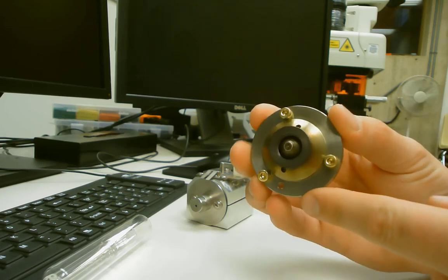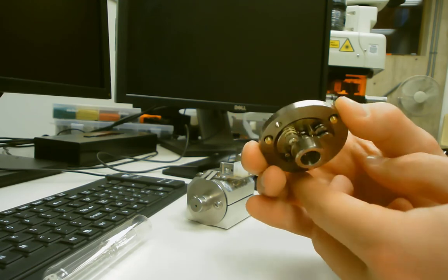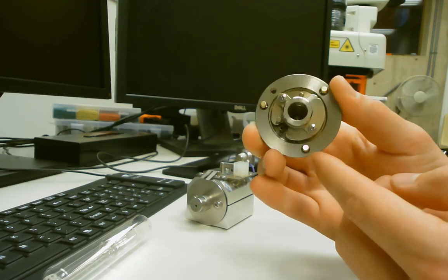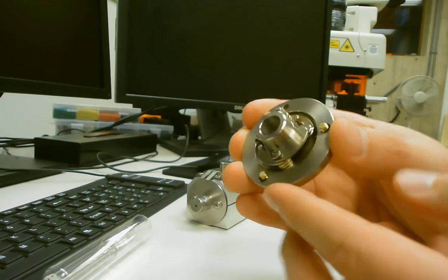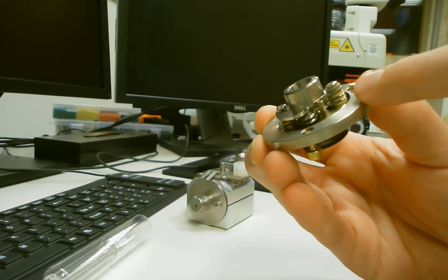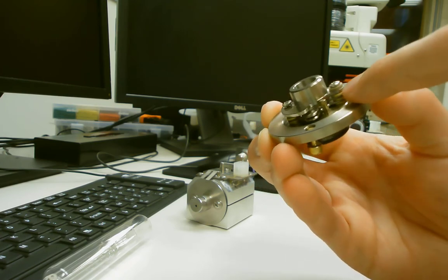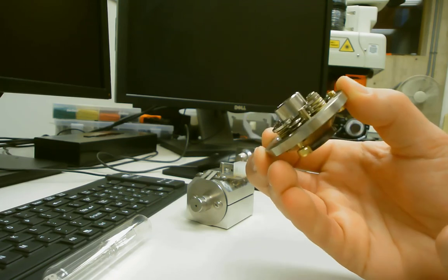And then this is a lens stack. This is an old lens stack, which is actually missing the deflector, so I don't have one that I can show you that has the deflector on it. But you can see the lens stack here with all the insulators between the different lenses where they attach. That's so that each lens can have a different voltage applied.